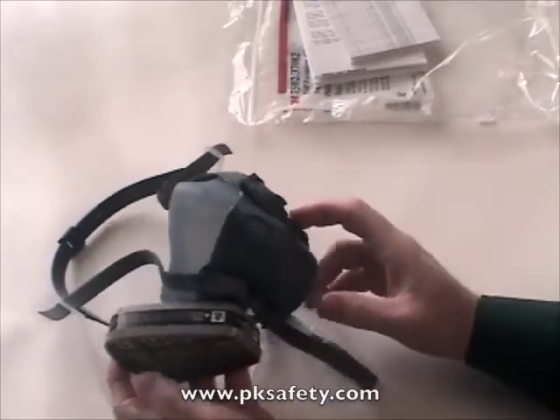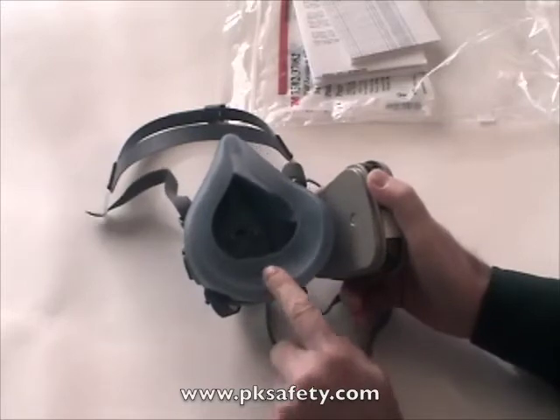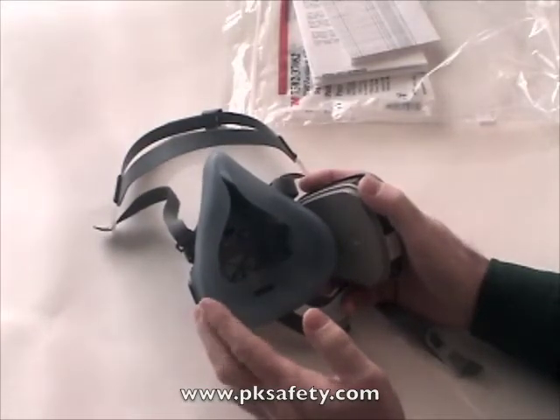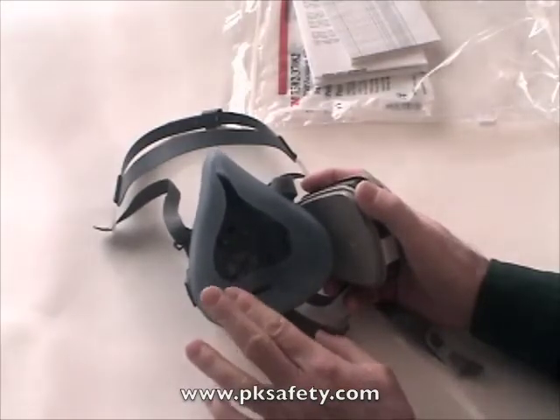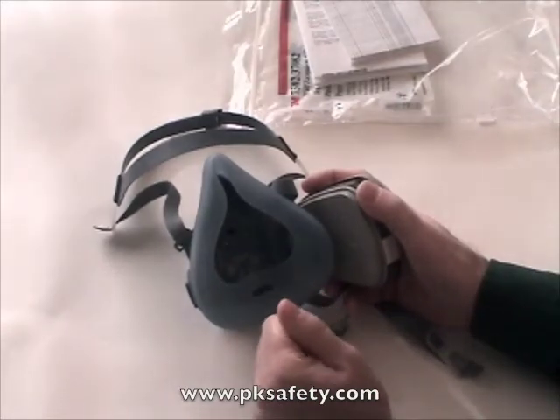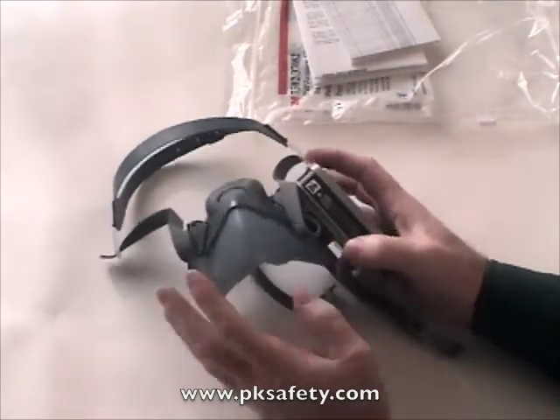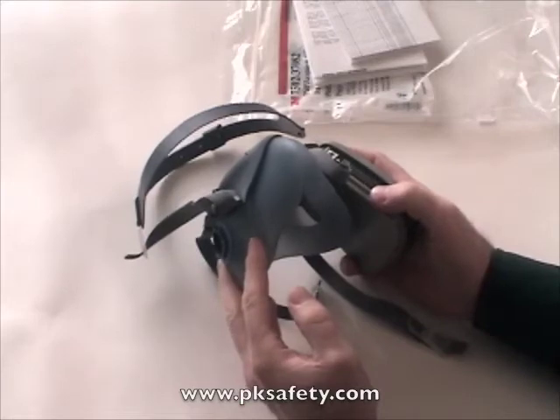Then it's ready to go. The point of your chin goes in this cup, where there's a little sweat drain. The beauty of silicone is it's very soft and inert, which means that if you have allergies — whether contact allergy on your skin or an allergic reaction to some types of rubber — silicone is not going to cause a problem. Also, it's very difficult to get things to stick to silicone, so if you're painting, the paint and other things like that can be washed off without a problem.